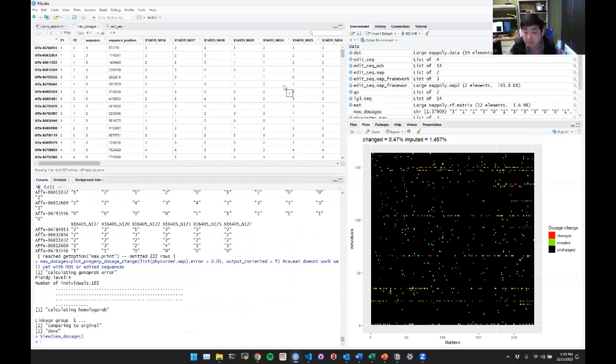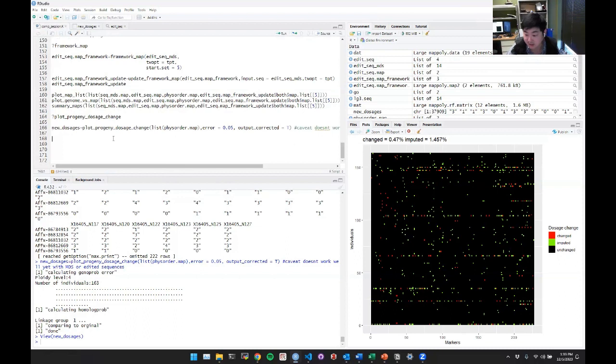So you could use this for a variety of things. If you've already run a map, you know that this map is what you want, then you could export this and the chain would have to make a lot fewer changes. It would actually run through the mapping a lot faster because everything's what it's expecting it to be. With that, I think that's all the changes and edits that I have to share.